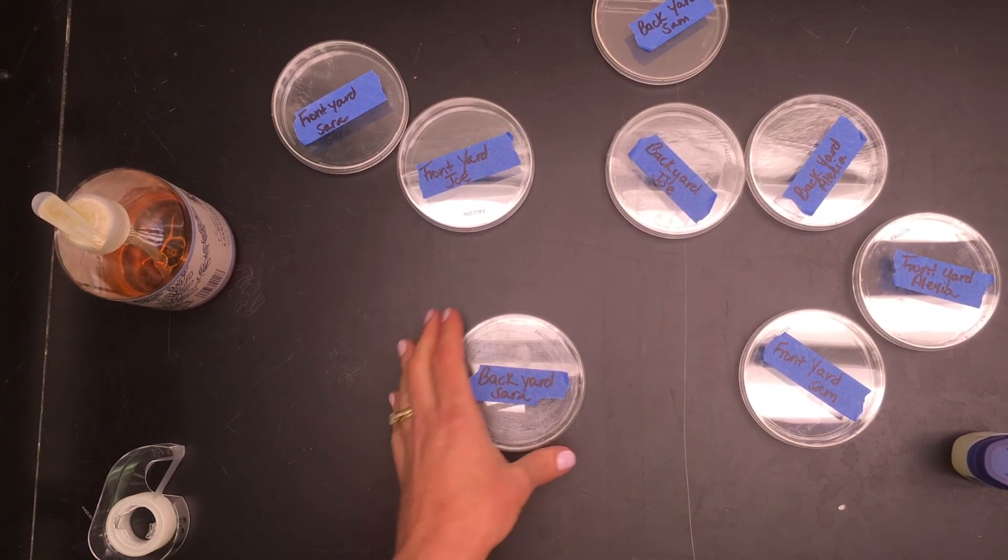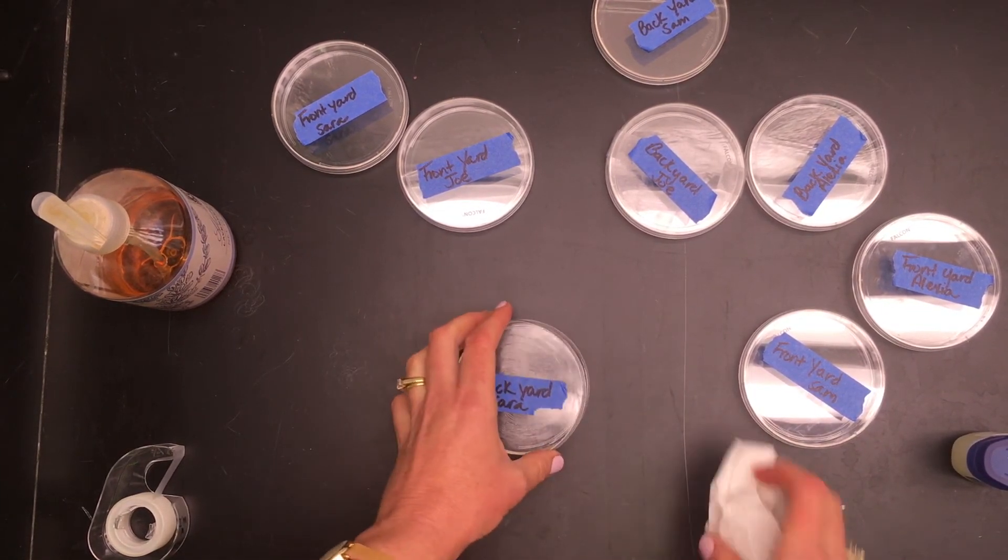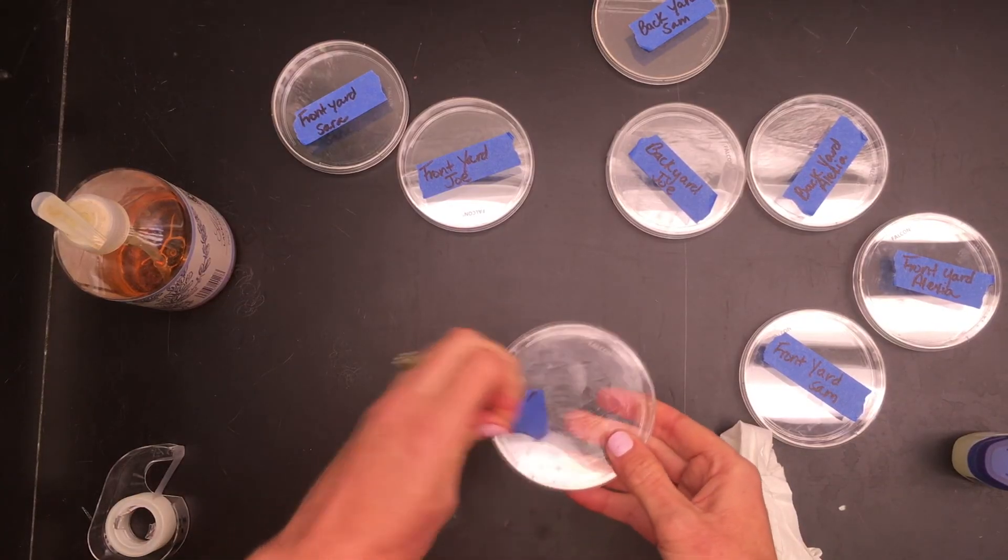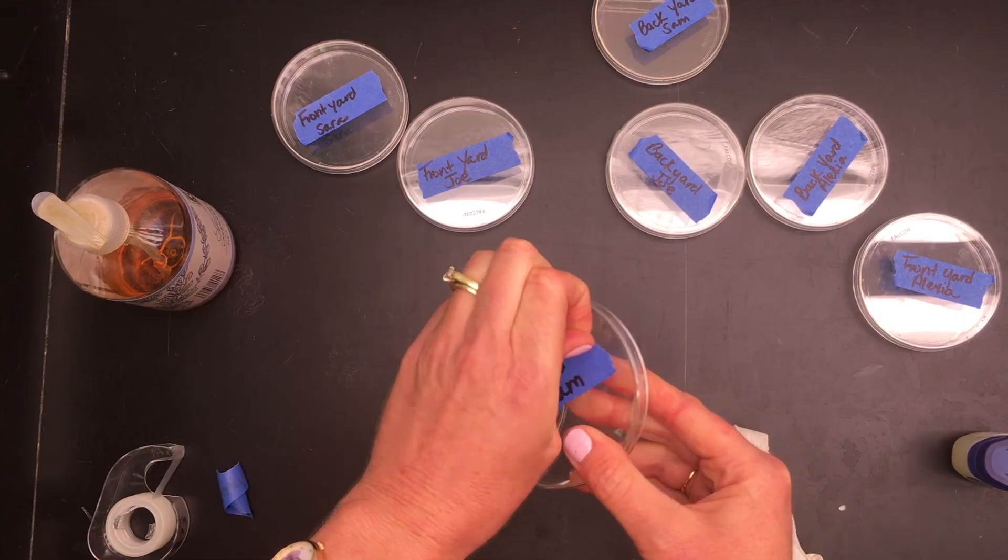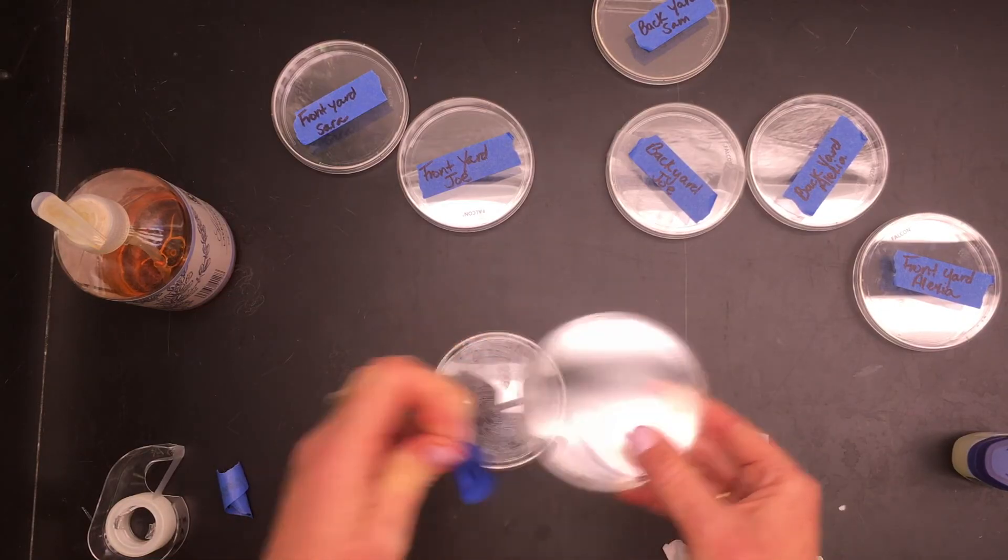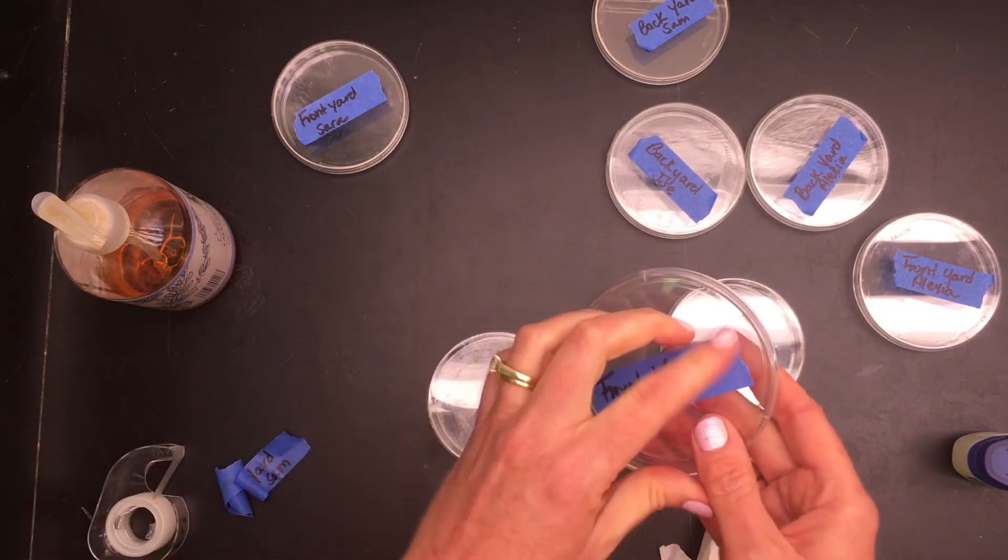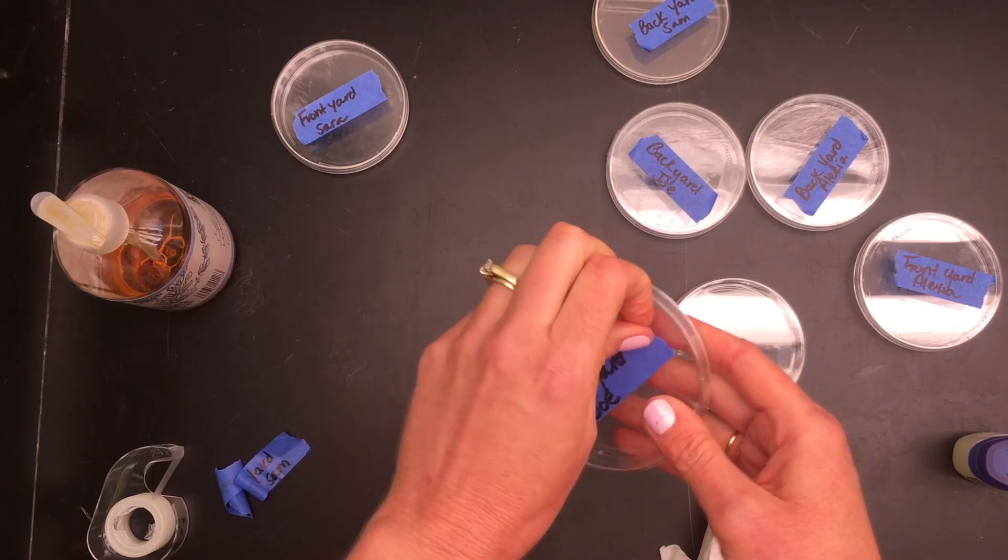When you're done getting all of your data, you need to clean the dishes. So you want to peel the painter's tape off of all of the trays so they can be reused again.